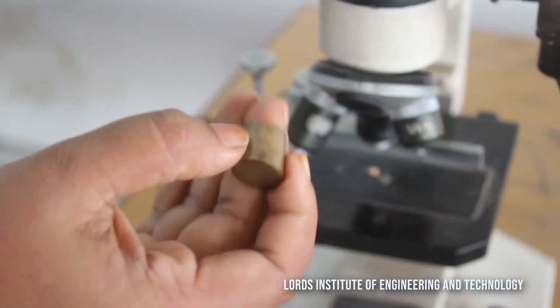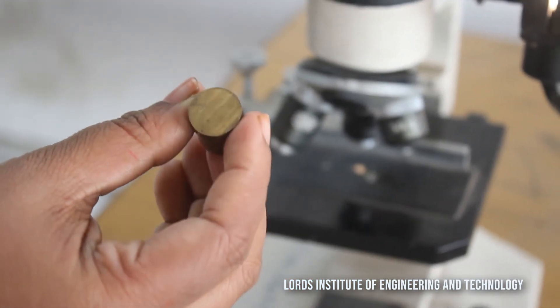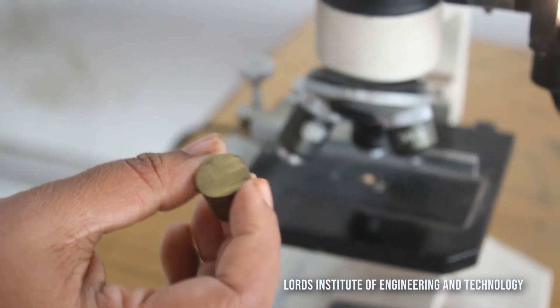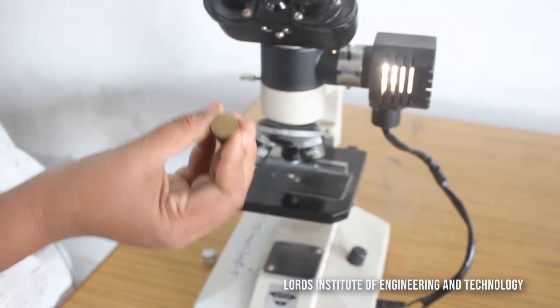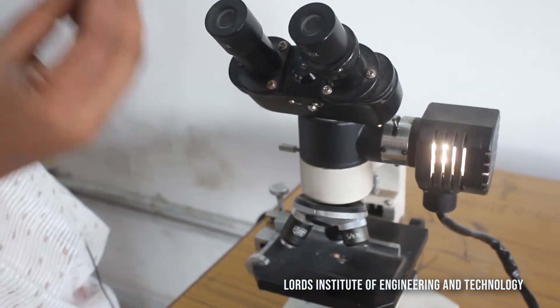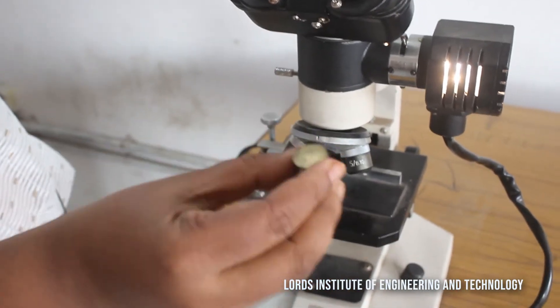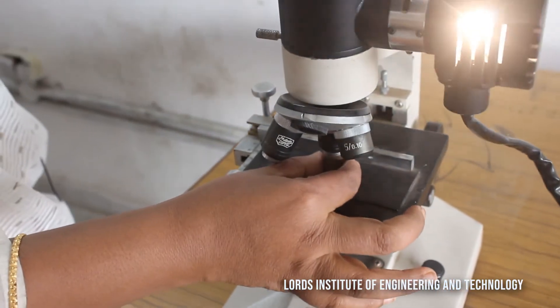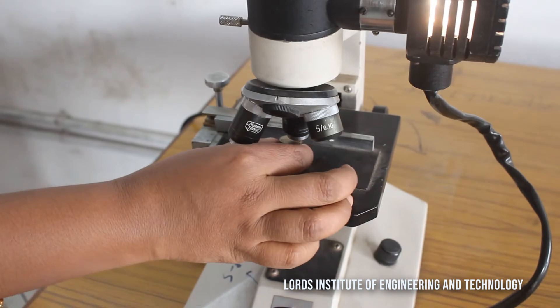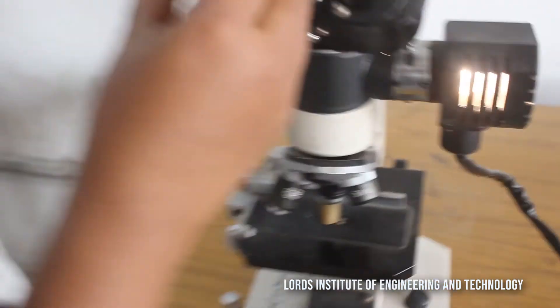We have now seen the grinding, disc polishing, use of etchants, and rubbing on the emery papers for this brass specimen. Now we will see the microstructure of this particular one. Let us place the specimen under the microscope and adjust the lens to view the microstructure — we are going to see a fine structure.